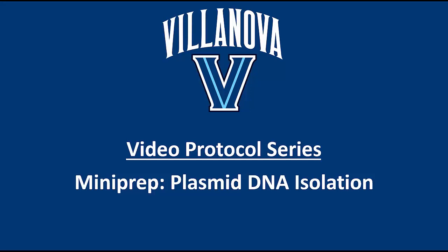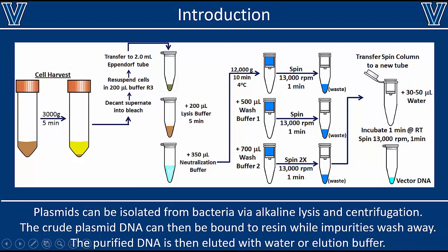Hi everyone, in this video I'm going to show you how to isolate plasmid DNA from bacterial cells using a Miniprep kit. So this is a general overview of what the process typically looks like. There's a lot of different Miniprep kits out there, but they all follow basically the same routine.